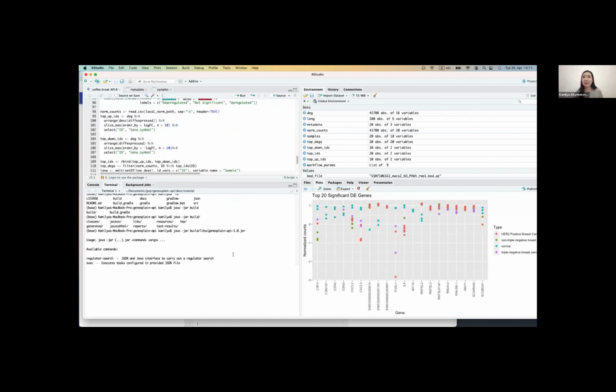Uploading it to the platform, which already knows how to work with a lot of data types, can accelerate the process even for a very experienced user. The same goes for the tools. Instead of using many tools, and this is the beauty of the geneXplain platform, some tools are just wrapped in a nice interface in the platform.